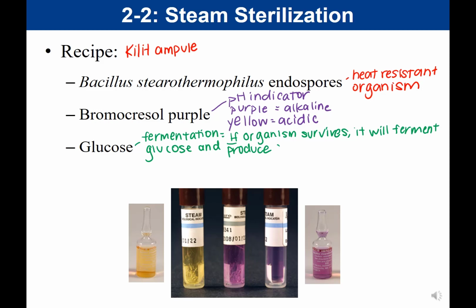And produce acidic products. So it will decrease the pH.